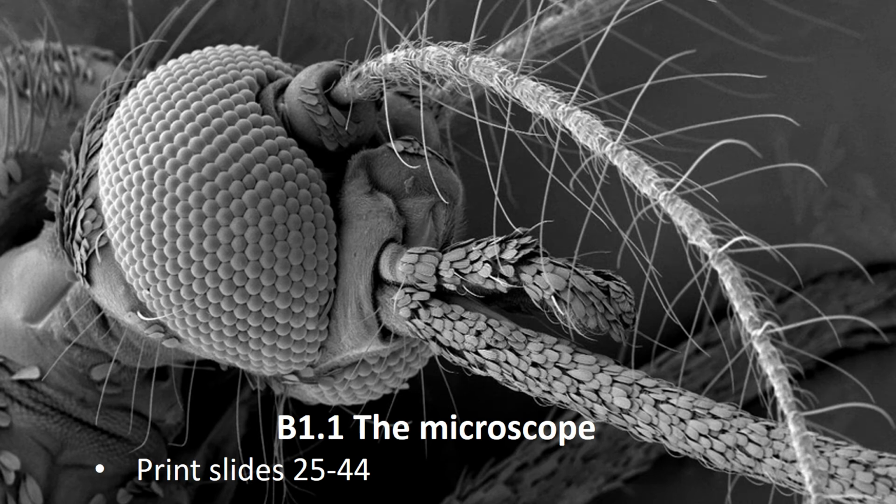So we're going to be looking at microscopes today. Now there is another lesson that goes with this that is about the required practical and how to make a slide. You will have the opportunity to do that, but I have made a video on that for you as well. So let's kick off with labelling an average looking microscope that you might use in science.